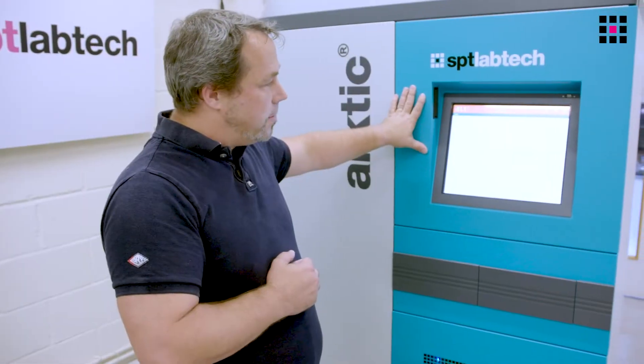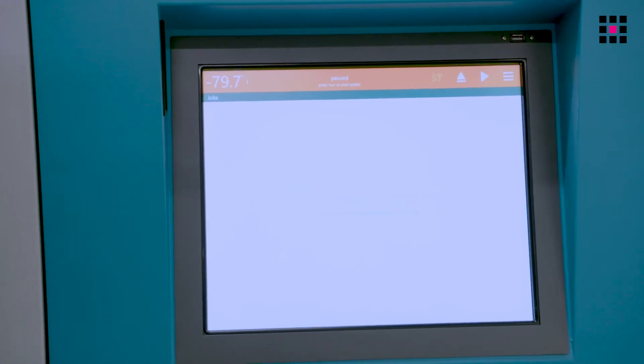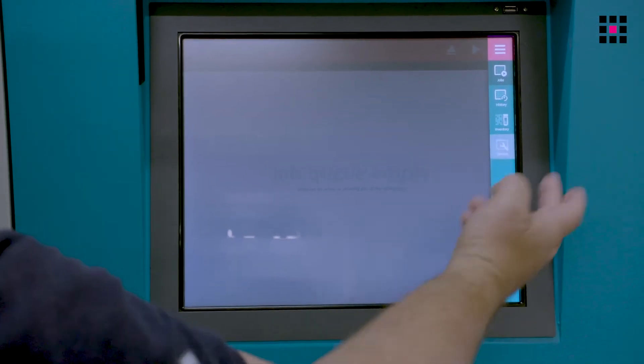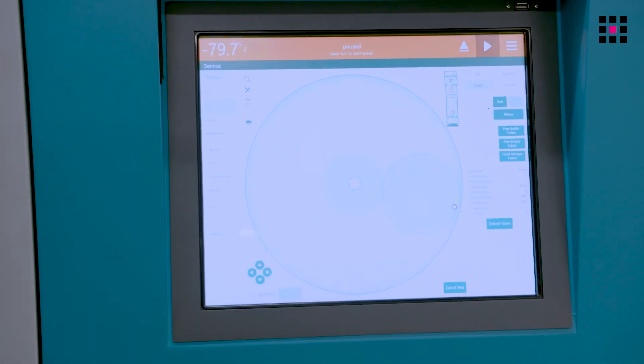Up here you have the HMI interface, where you can operate the machine with the jobs, history, and you can do service intervention from here, which is all a graphic interface.